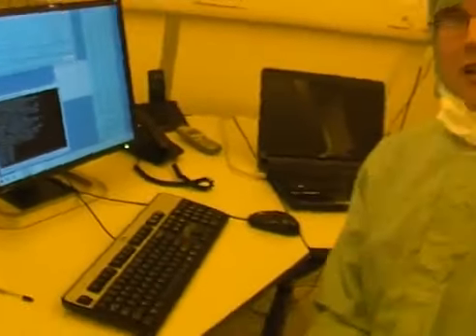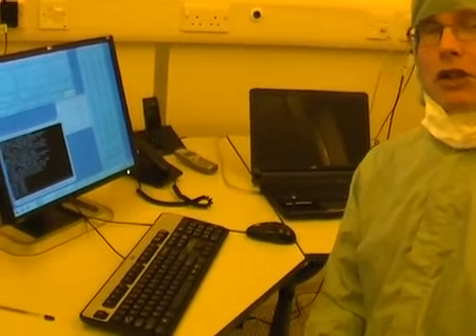So almost all calibrations, hardly any writing at all, which is not the most efficient way to run the machine. Ideally you'd have a job which lasts for considerably longer than the calibrations. So since calibrations take 5 to 10 minutes, you'd like the writing to take half an hour or so to be more time efficient. That isn't always possible. So this particular sample was very small for very good reasons, and that was all the writing that's required.